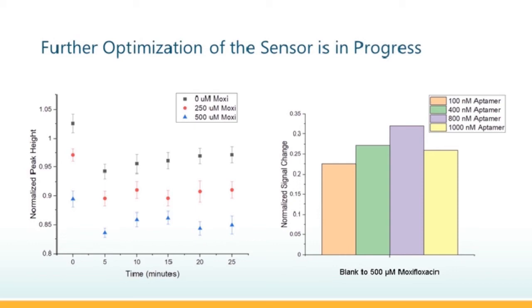And you might have some fluctuations over time, but the difference between them is always the same. And so as we go to an inkjet printing approach and have a known definite quantity of aptamer each time on each electrode, this will be even more reproducible.